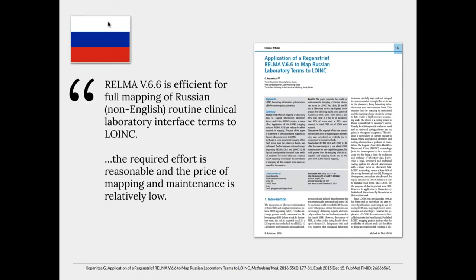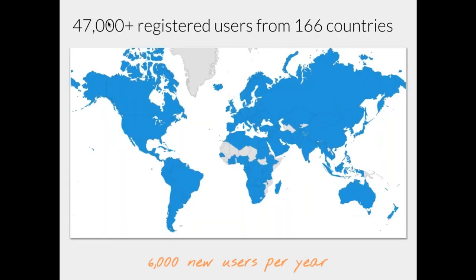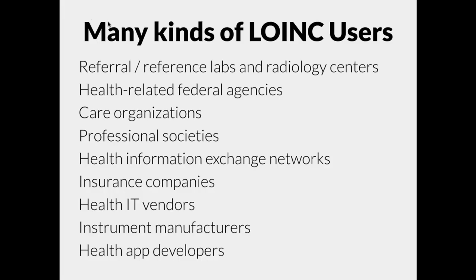A paper last year also came out describing the use of RELMA to map local Russian laboratory terms to LOINC codes. And I included this to give you hope that by the end of the day, you'll say, maybe I too can say that this is true. So their experience in using the translation part of RELMA was that the required effort is reasonable, and the price of mapping and maintenance relatively low. So overall, they were satisfied with using the tool for the job they were trying to get done.